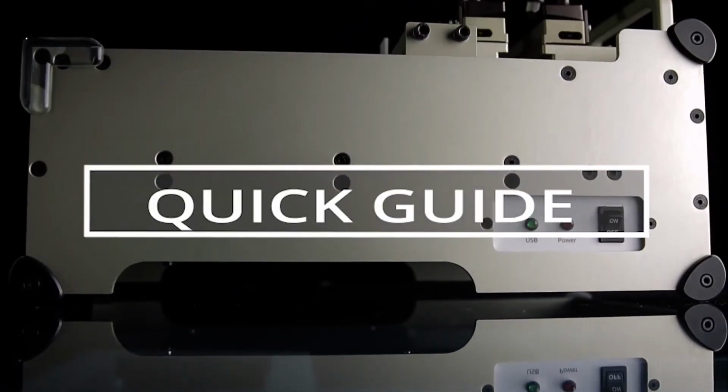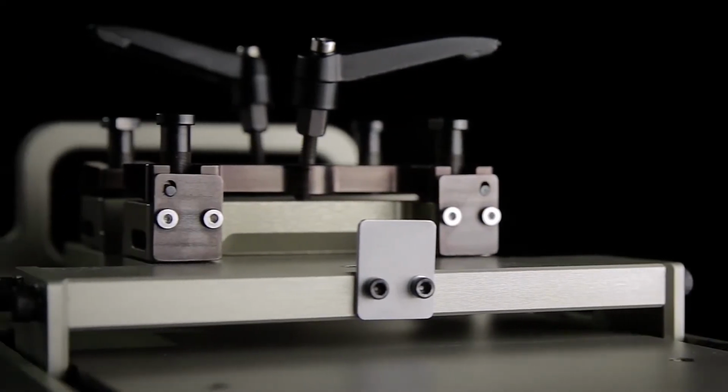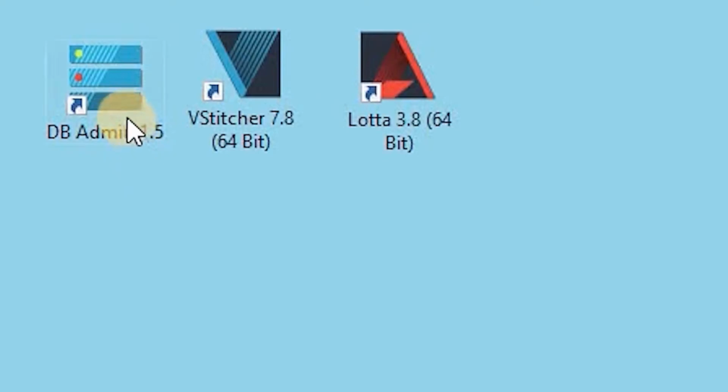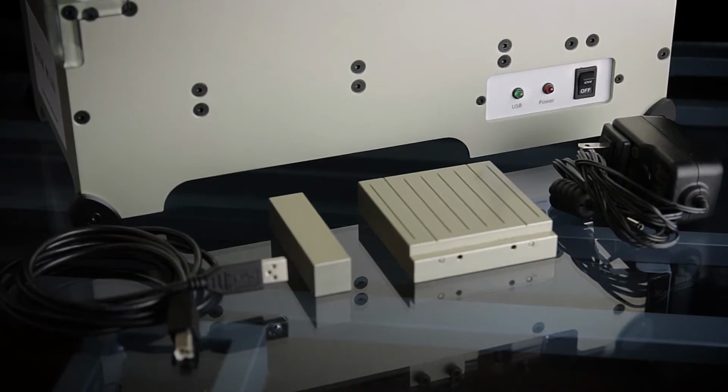Welcome to part 2 of our 2-part quick guide video series for the Fabric Analyzer by Browseware. In part 1, we provided an overview of the FAB's parts, accessories, and their function, as well as the basics of installing the DB admin software and setting up the equipment. So be sure to check out that video if you need a review.